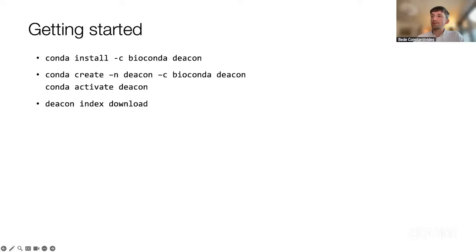I did think about adaptive sampling because I always wonder the extent to which bioinformatics limits the performance of adaptive sampling. But my understanding is that getting a bit faster at recognizing what's coming out of the pore is not really the limiting factor. The performance of the bioinformatics is not really the limiting factor for how good your adaptive sampling is. I don't know if that's the question that's being asked, but I'm happy to discuss again if I've got it wrong.